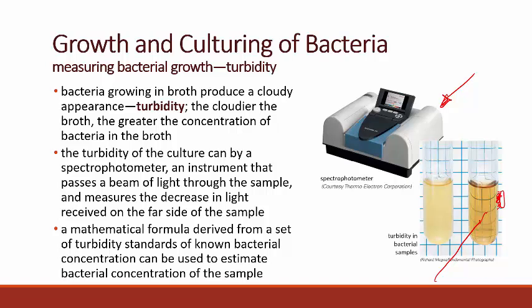And so if you know that a density of bacteria in a sample will absorb X amount, you can then produce a graph of a known. So we would see absorbance here, and no, actually, I'm sorry, I got that backward. This is absorbance. This is the amount of light that gets absorbed. So down here it's 0 light is absorbed, up here is 100% of the light is absorbed. And then you have a curve that you can plot your number against.